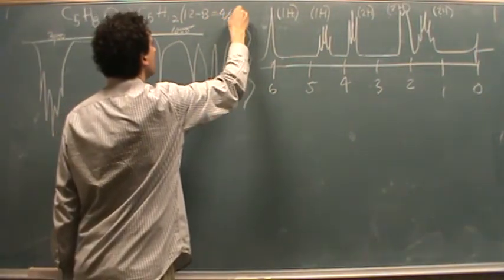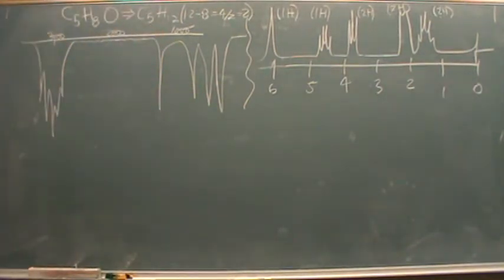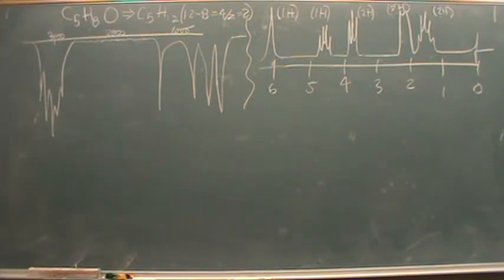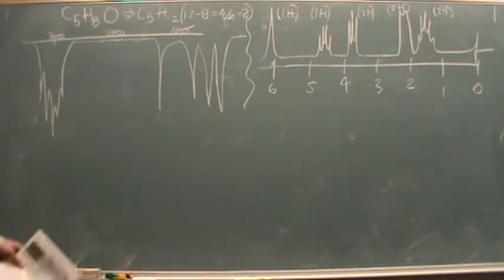Divide that by 2, there's 2 degrees of unsaturation. So that could be 2 double bonds, a ring and a double bond, that sort of thing. So I think any of those could be possible. If it's a straight chain, or if it's a ring, I think there's oxygen in it. Okay. So I'm sort of leaning towards the ring and a single double bond, but I guess anything could be possible. All right. So I think the NMR is going to give us the rest of the information that we'll need.